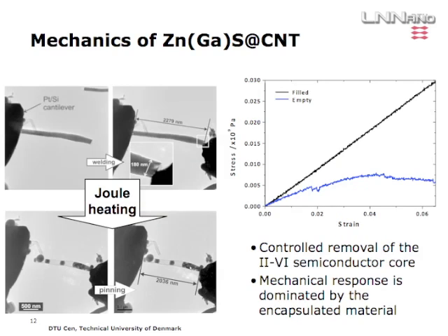You can also do force measurements. I think I just skipped this one because Raoul talked about this yesterday. But again, you can deposit material and see how the stress changes if the tube is filled or if it's empty.